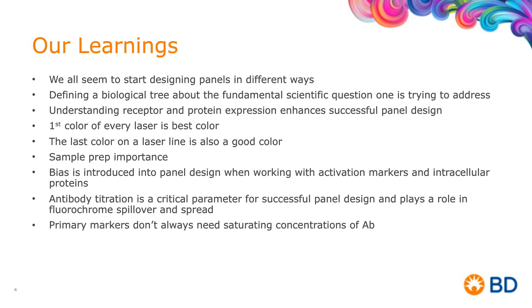One of the other learnings, too, that's critically important, and one that we have to be careful with, is that the antibody titration is a critical parameter. And this antigen density that's there, as well as the antibody titration from saturation, let's say, can be used to actually help drive down the cost of a panel. It depends upon where it is in the panel itself.